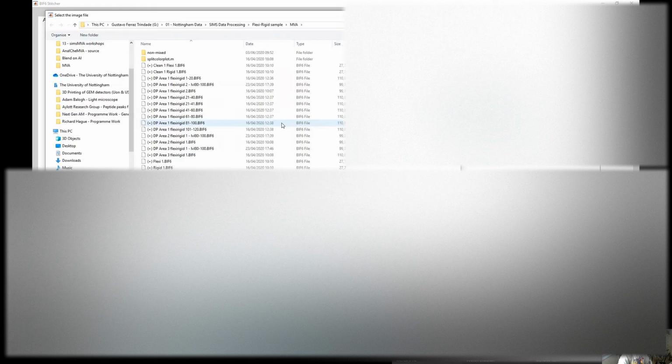And now, to show you, I will not say no compression. For each of those, I will say specify pixels, and I want it to be 128 by 128 pixels. Yeah, and then it loads with the size I asked it to. So this is the first one. We'll just do all of them.